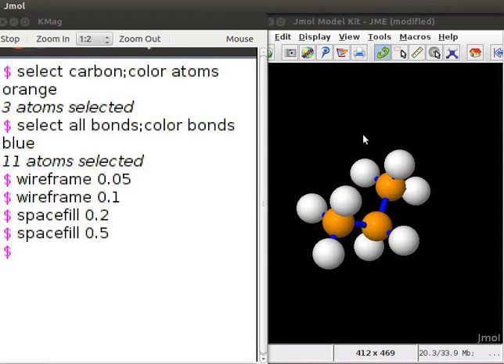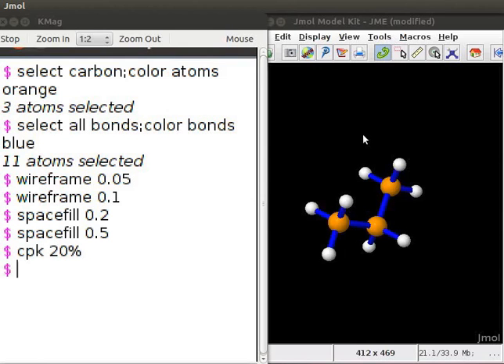Alternately, we can also use command cpk followed by percentage or decimal number. The percentage represents the van der Waals radius of the atom. For example, type cpk 20%. Press Enter. Note the change in the size of the atoms.